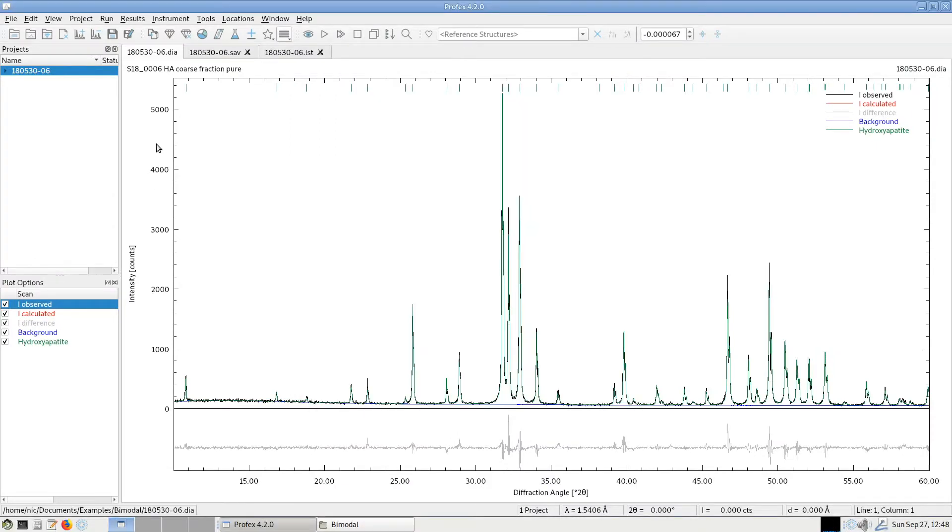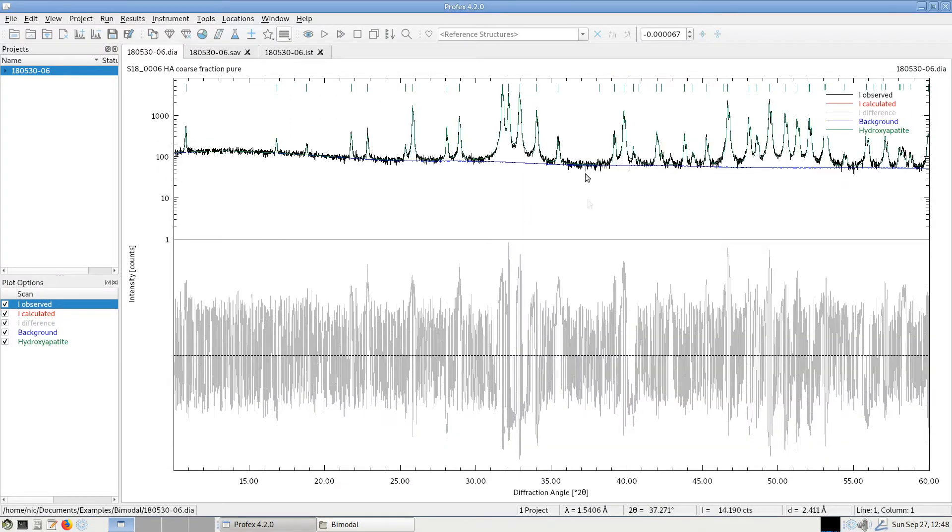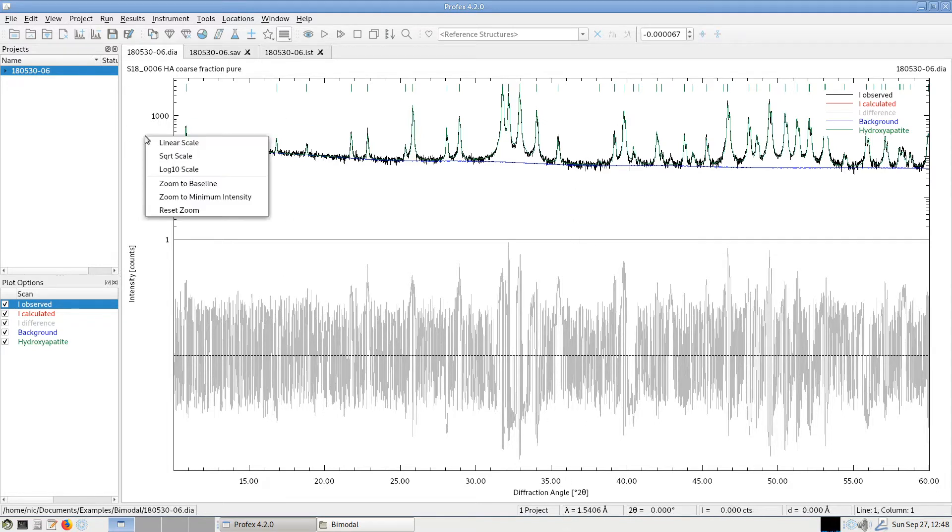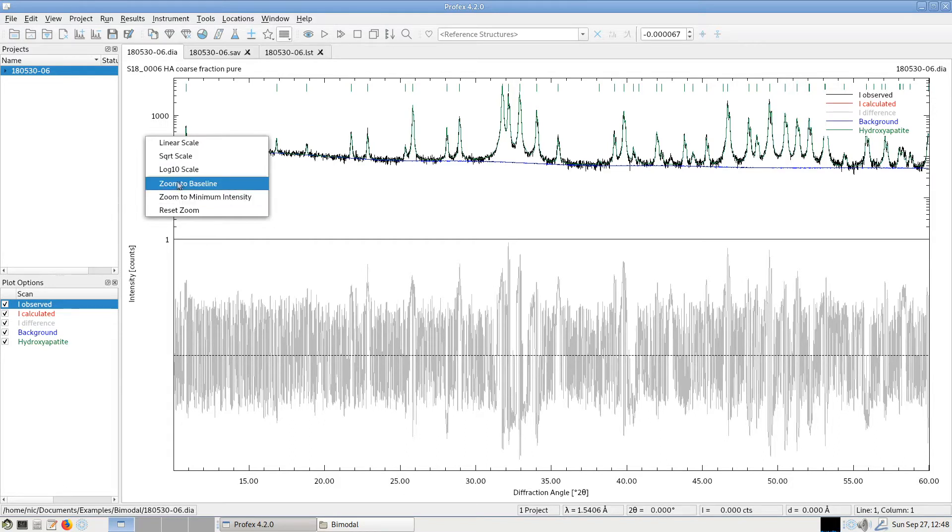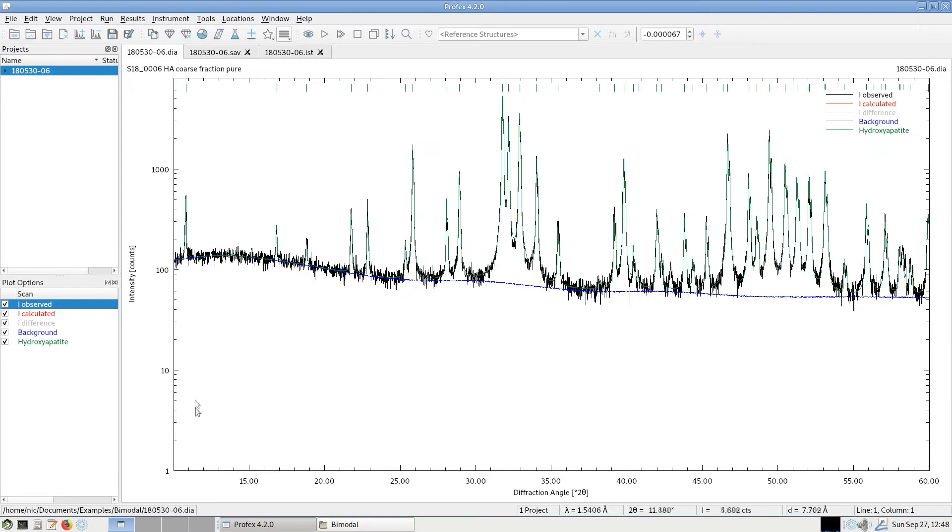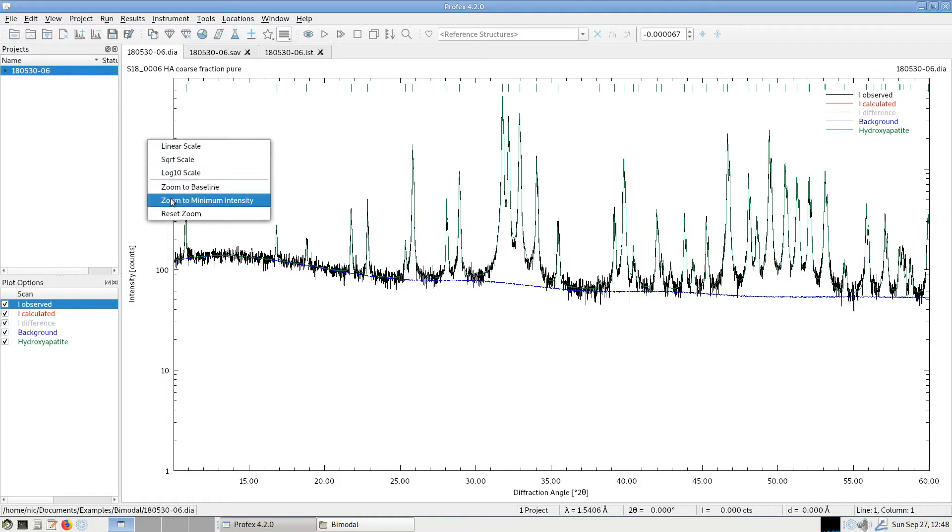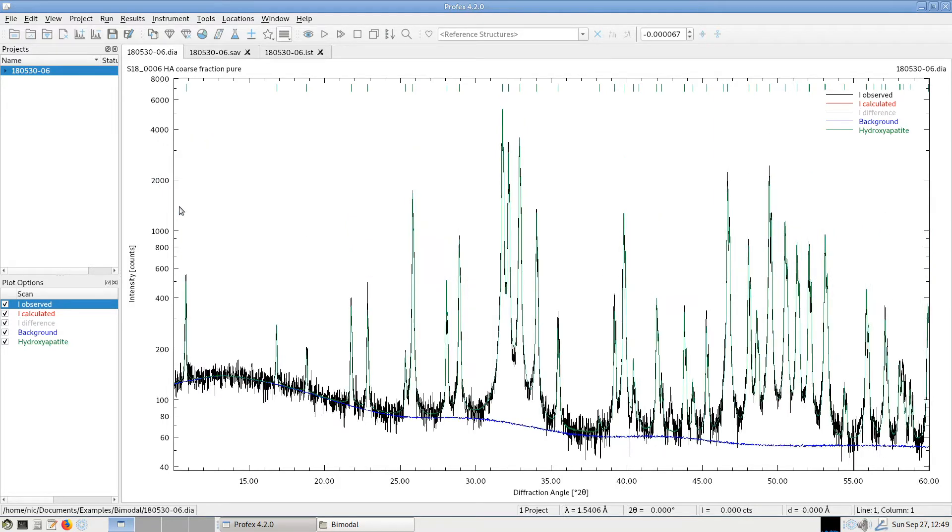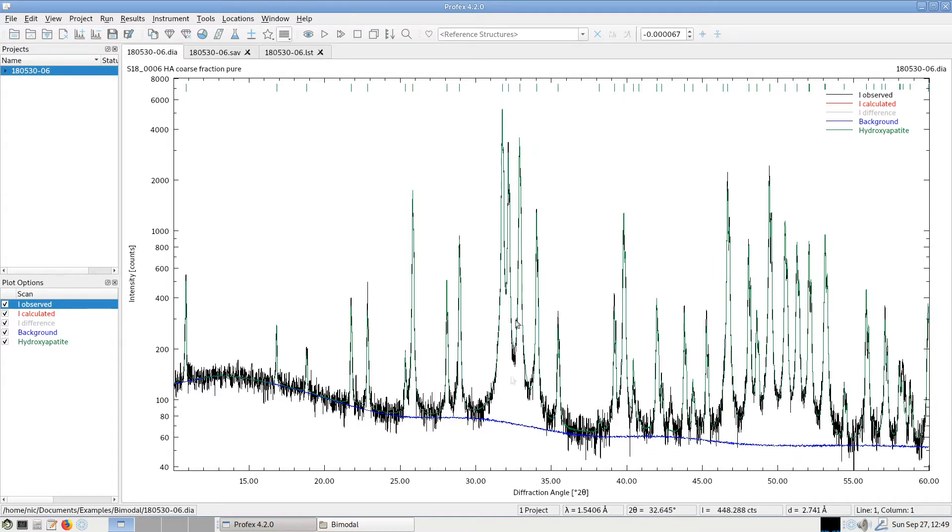If we set the scale, for example, to logarithmic, we get a lot of wasted space down here. And this is where these functions come in handy. We can zoom to the baseline, which in case of a logarithmic scale would be the value of one. So if we click here, it will zoom from one to the maximum intensity. But here we still have a lot of white space. So we can also zoom to the minimum intensity. Now it zooms from the lowest intensity in this scan to a bit more than the maximum intensity, and we make optimum use of the vertical area.